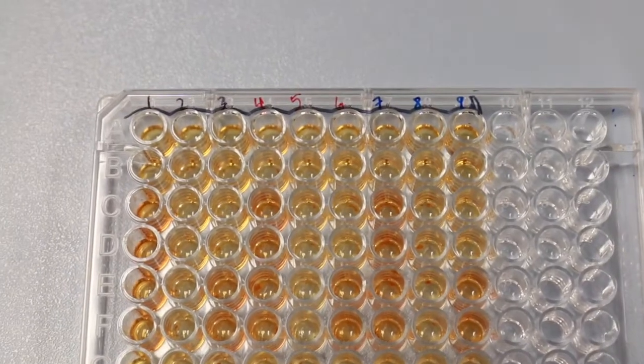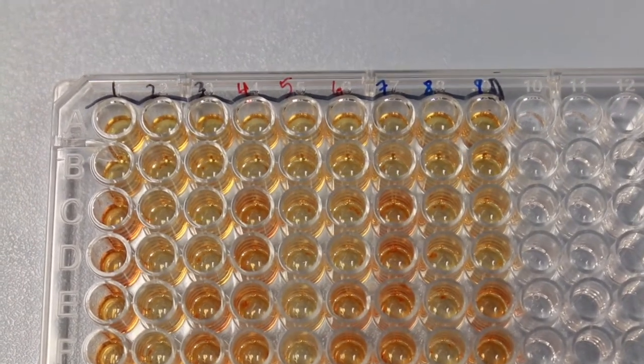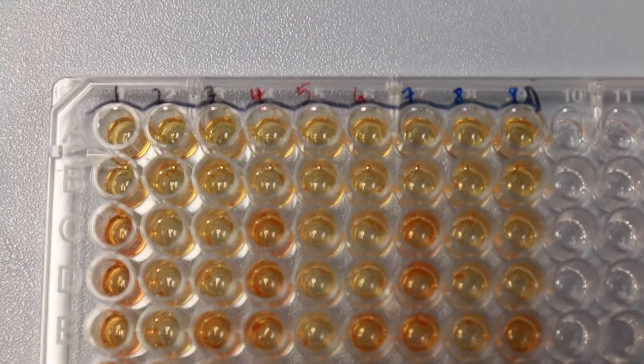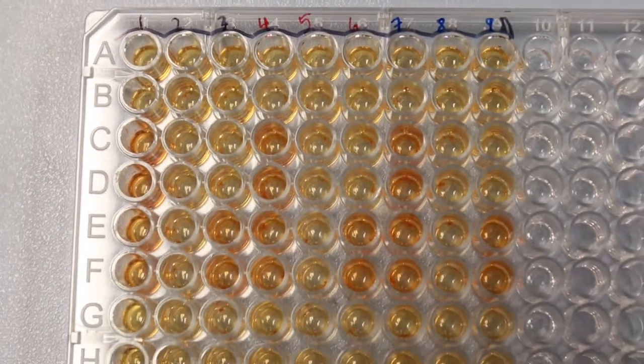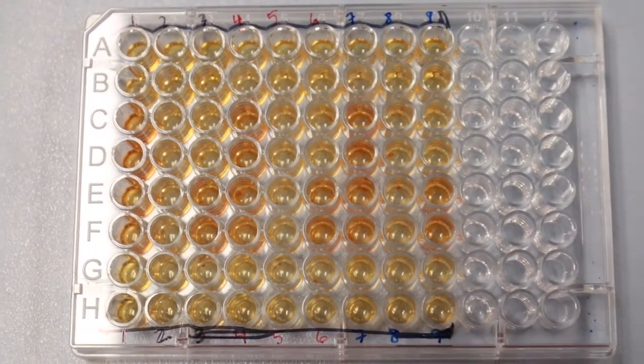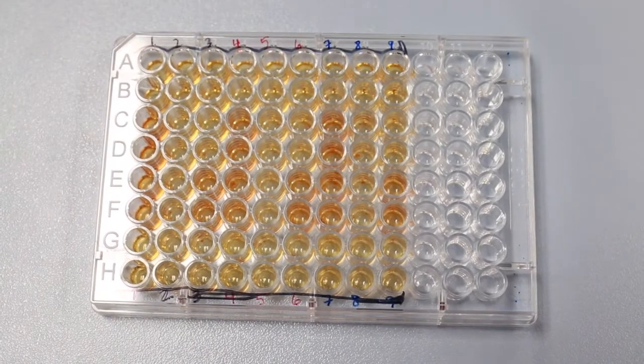When working with a solid plate in a detection or activity assay, use a Sharpie marker to outline the wells you have used. This makes it easy to know where you left off if you run additional samples on a different day.